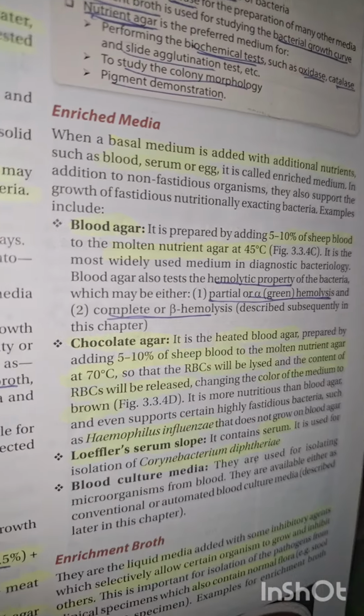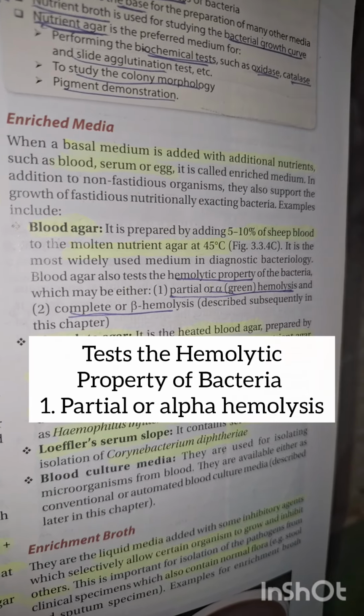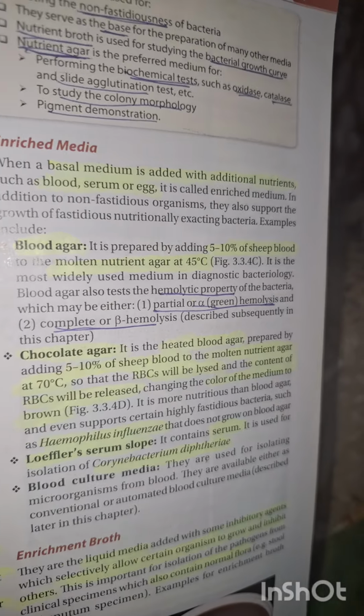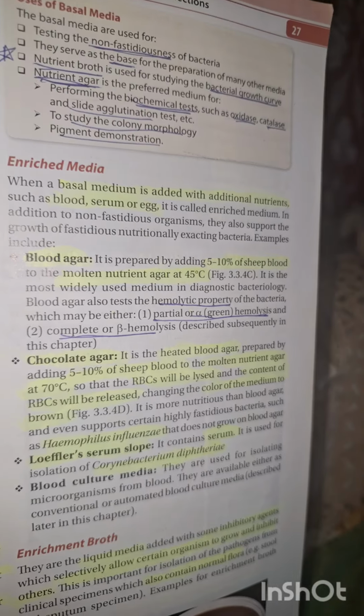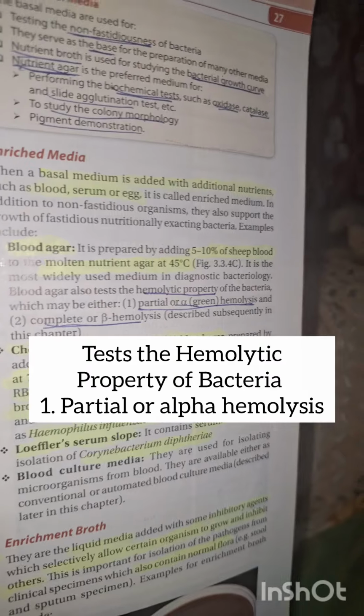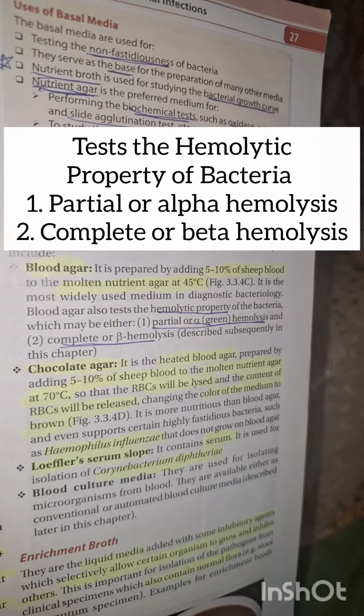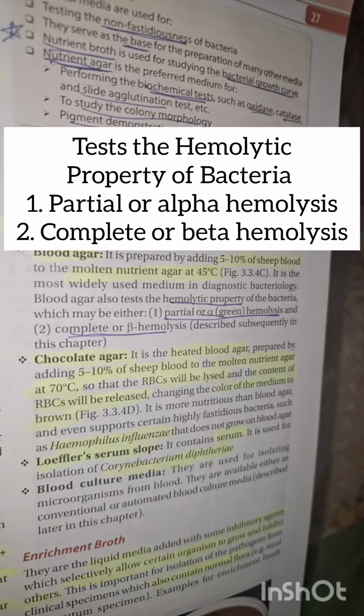The blood agar also tests the hemolytic property of the bacteria, which may be either partial or alpha green hemolysis, like hemolysis. As blood agar contains the RBCs, the bacteria lyse the RBCs, producing the hemolysis. So if there is a partial hemolysis, we say it is alpha hemolysis, and when there is complete hemolysis of all the RBCs, we say it is a beta hemolysis.